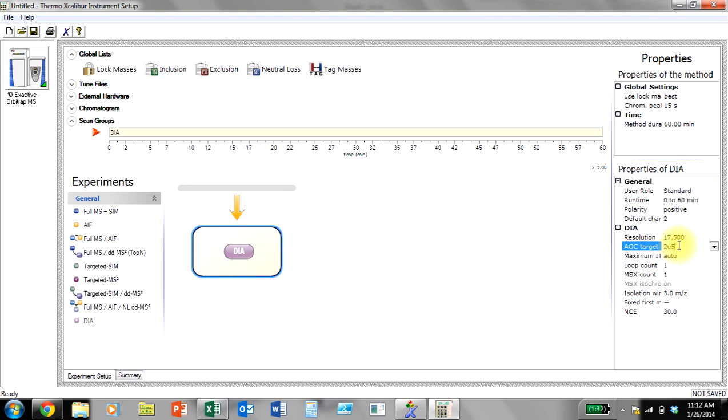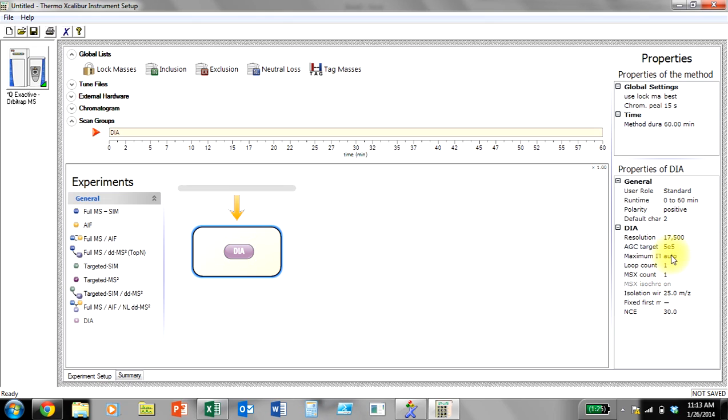In a presentation that Dr. Makarov gave a couple years ago, he said that we started to see space charging with an m/z range of 2, at about 2e4 to 5e4. In this case, I plan to run an isolation width of 25, so I'm thinking that would be about 10 times as much. So I think I can get away with a target from 2e5 to 5e5. In this case, I'm going to err a little higher and say 5e5, because I am looking at a 25 Dalton window instead of a little more than 10 times where we saw that space charging.